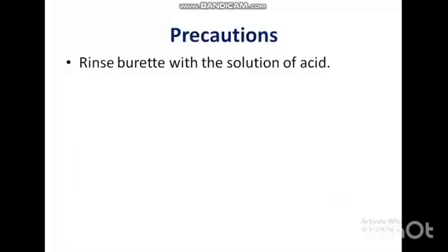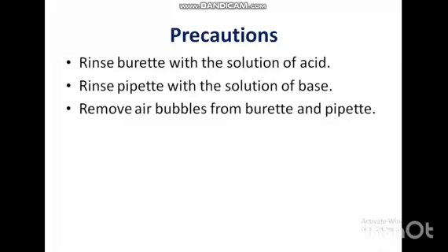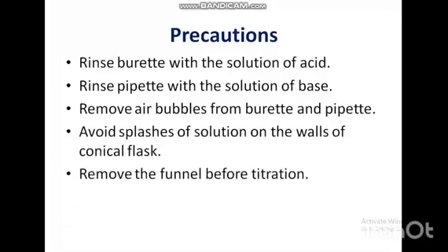1. Rinse burette with the solution of acid. Rinse pipettes with the solution of base. Remove air bubbles from burette and pipettes. Avoid splashes of solution on the walls of conical flask. Remove the funnel before titration.